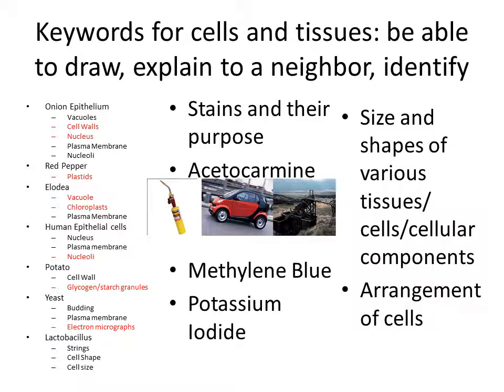So the other part of this chapter is to look at cells and tissues, and we're going to be looking at subcellular structures as well as the integration of whole tissues and the different kinds of cells that go into those. On this slide, I'll make a few points. First is mnemonics do matter. That's why I put this in here. You could remember that one of the stains is acetocarmine; if you can't remember just those words together, you might want to imagine what they look like.